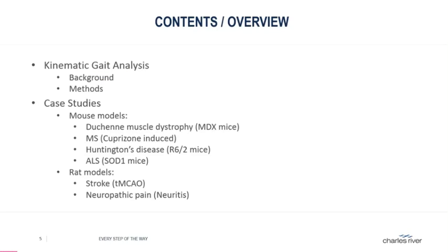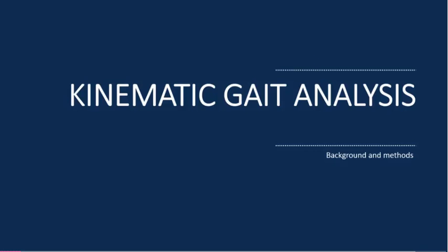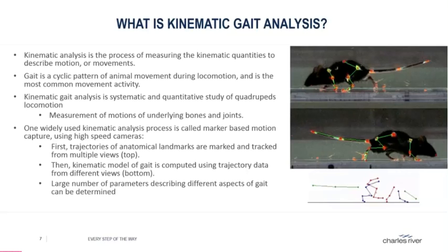Here's the outline of this presentation on kinematic gait analysis. First, we go through the background and methods. Second, we will take a look at a few case studies with different rodent models. And let's first talk about the background and methods of kinematic gait analysis.